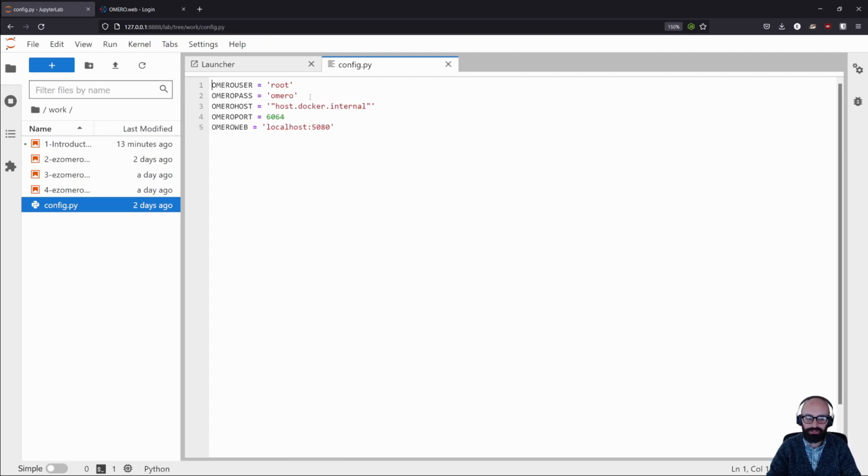When I'm working with this on a GitHub repository, for example, I normally have it as a local file that is added to my gitignore, so it's not uploaded to GitHub itself. I make sure it's accessible only for the user I'm using, and I don't keep it saved between sessions or keep it saved without the password. So it's very convenient to work with this, but it's something you should keep in mind in terms of security. So don't store your password in a regular text file that people have access to, is essentially what I'm saying.